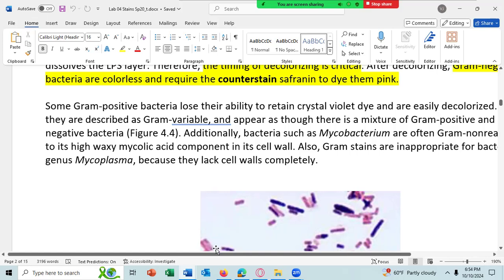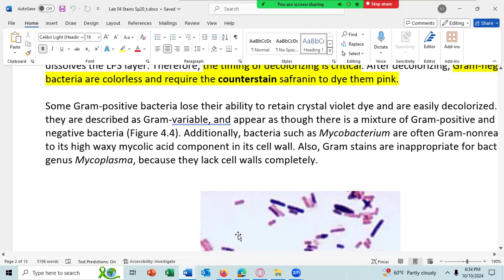And these cells are probably dead cells, which is why they have a break in the cell and why the cell looks a little ghostly, not entirely there, sort of like a ghost. And these cells are viable, and so their cell wall and cell membrane are intact. And these cells probably are non-viable. And that's probably why the cell is broken, why that cell is mostly a ghost.